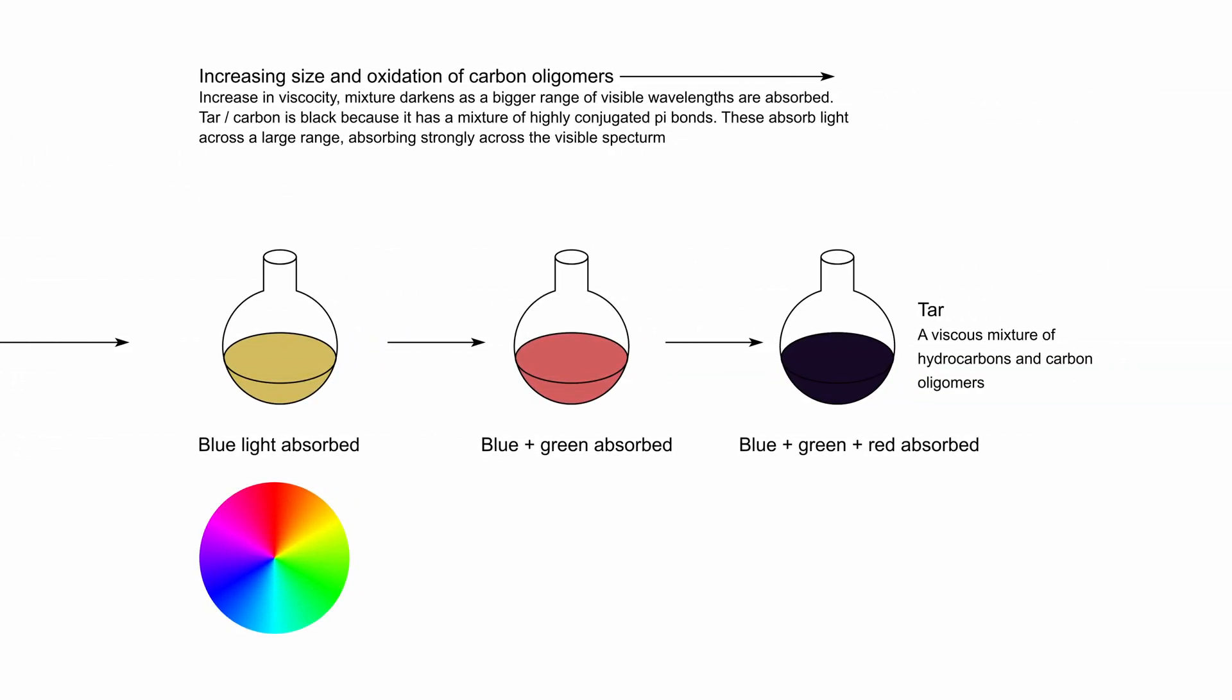If we look here we can see this process causes a color change. As the molecules get bigger and more oxidized the reaction mixture gets darker and moves towards red. The color change happens because at first smaller molecules with fewer double bonds will absorb higher frequency light in the visible spectrum, blue light. If we look at our color wheel the complementary color is yellow. So we start off with yellow then as the molecules get bigger they will start absorbing across blue and green giving us the complementary color red. And finally when we have a big mixture of varying size molecules we will get absorbance across the entire spectrum giving us effectively black tar.